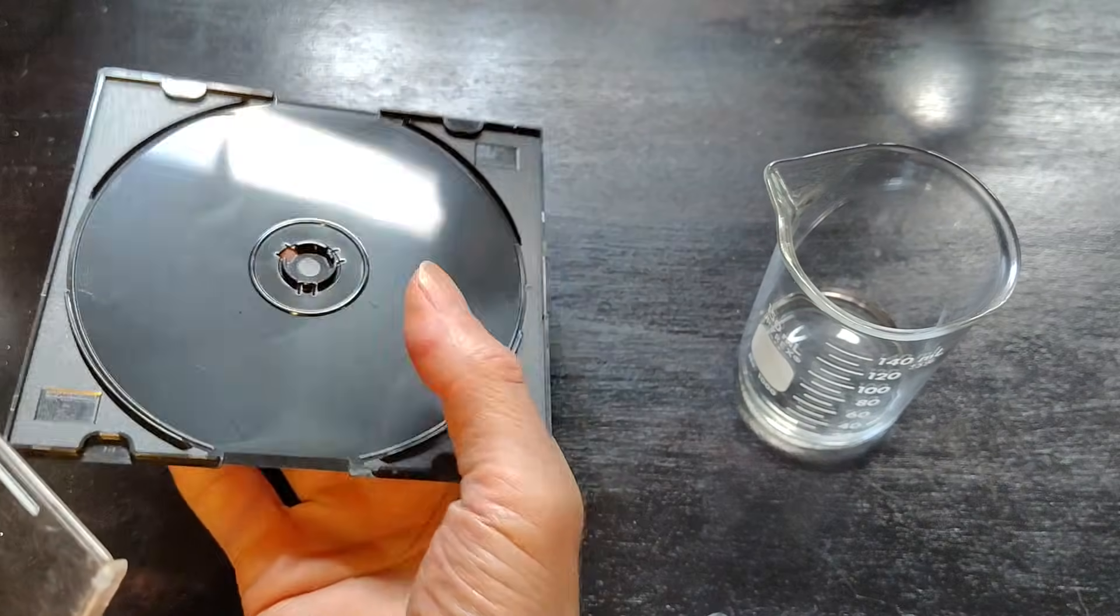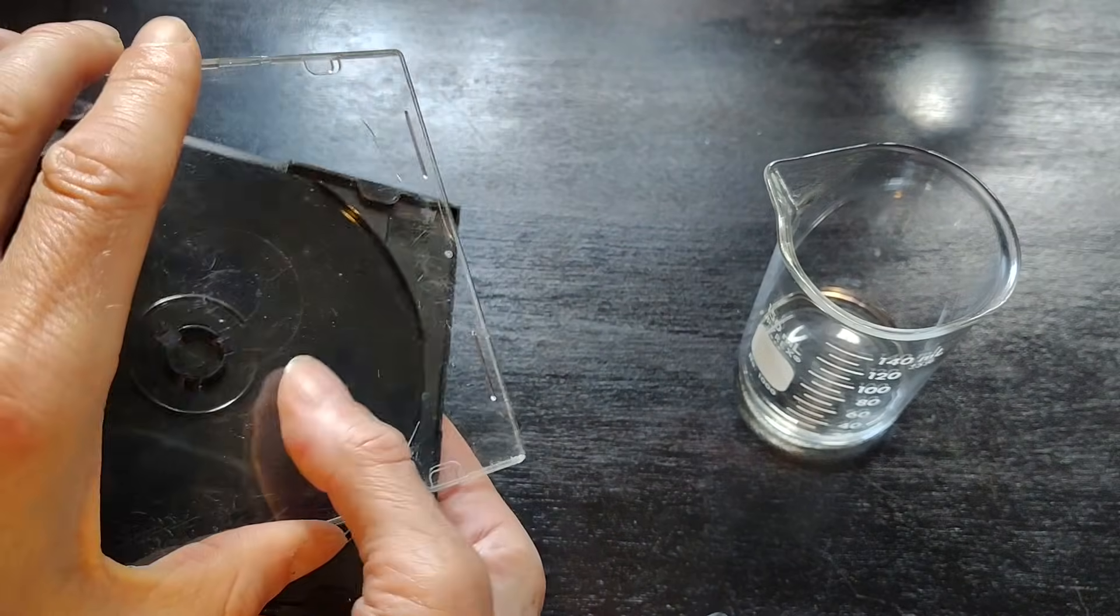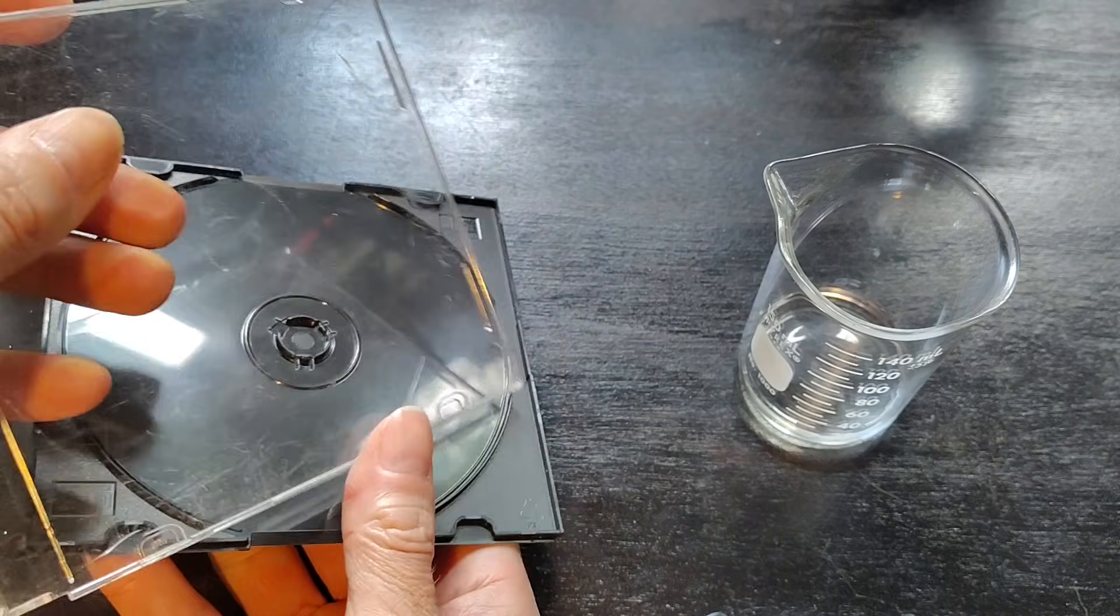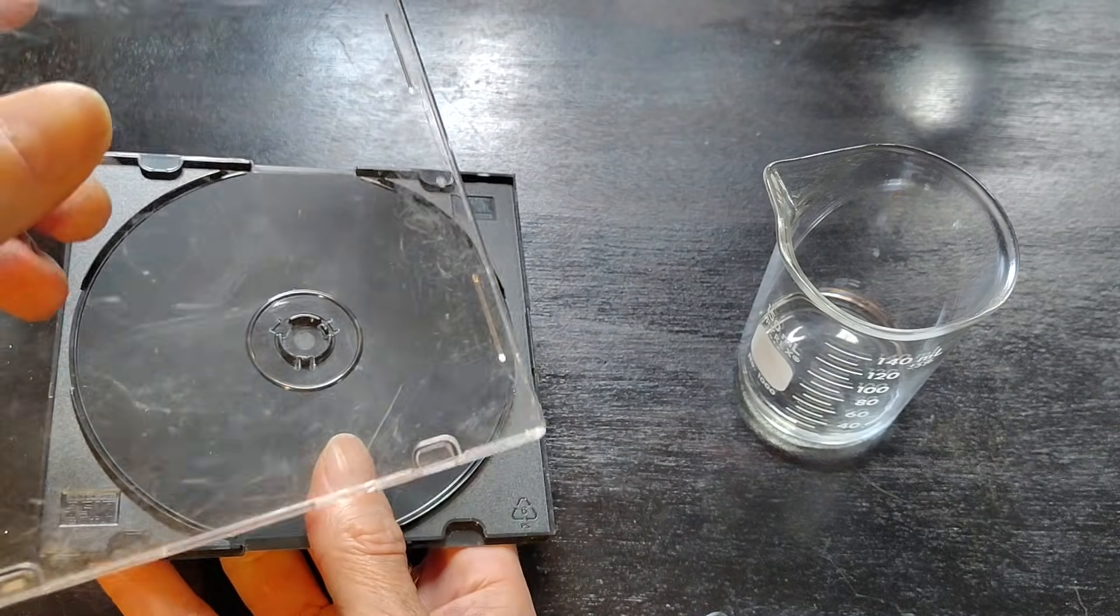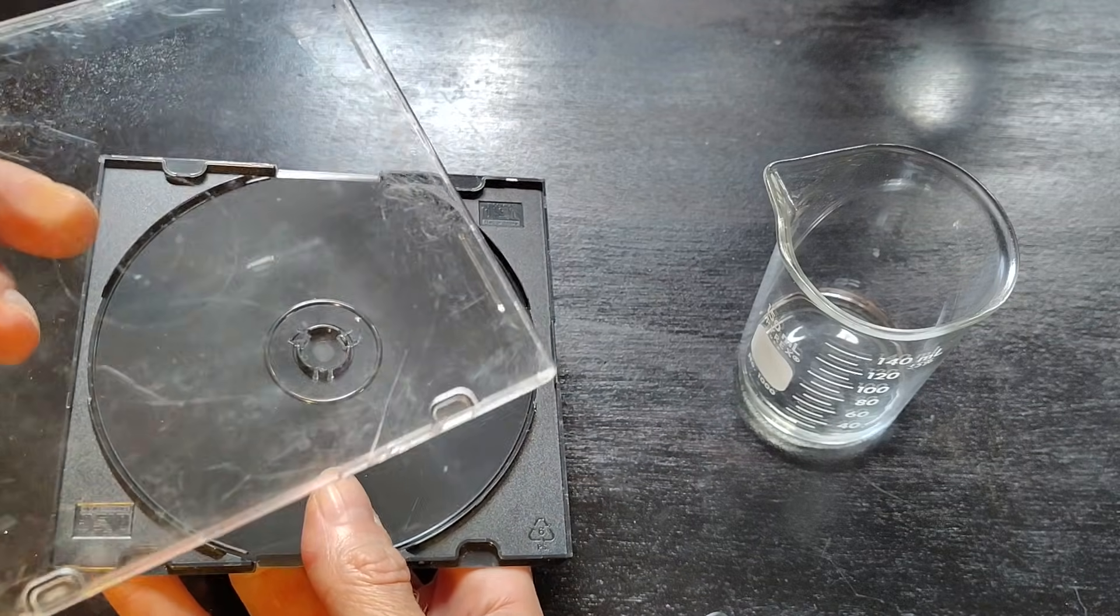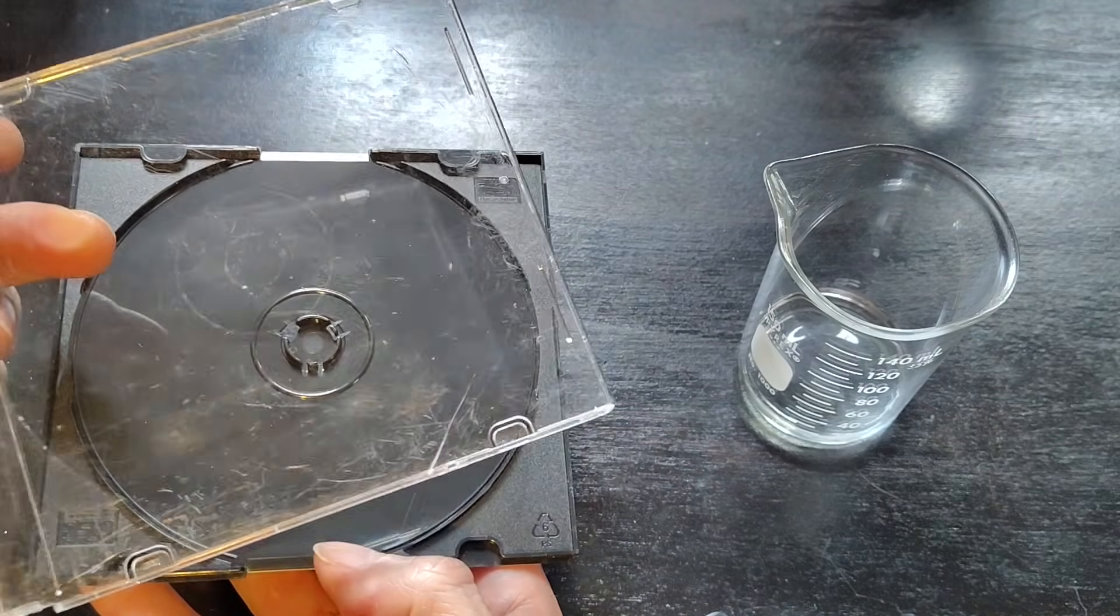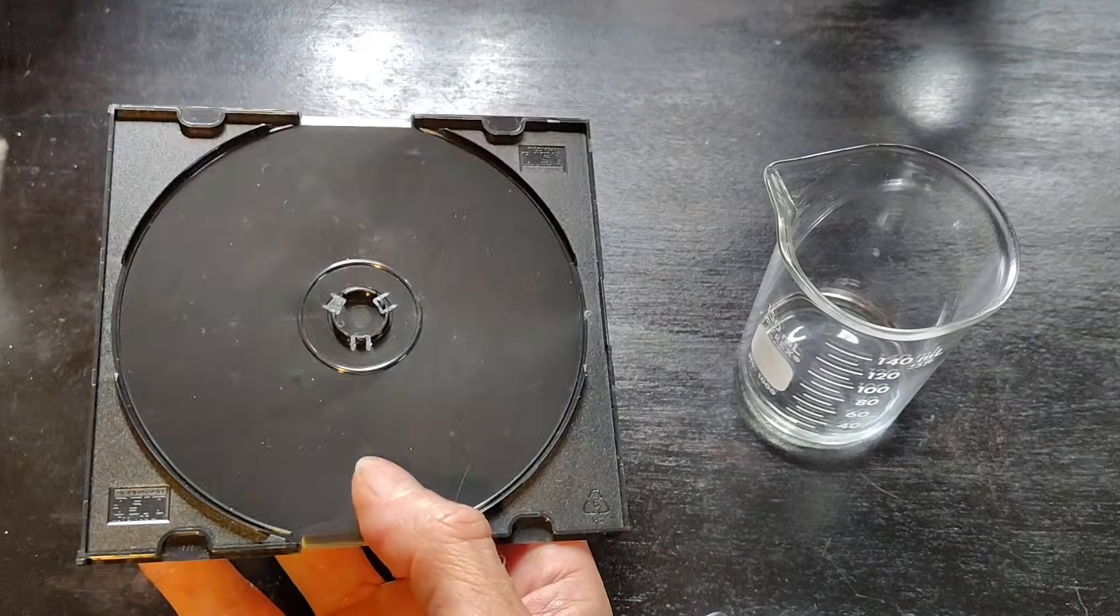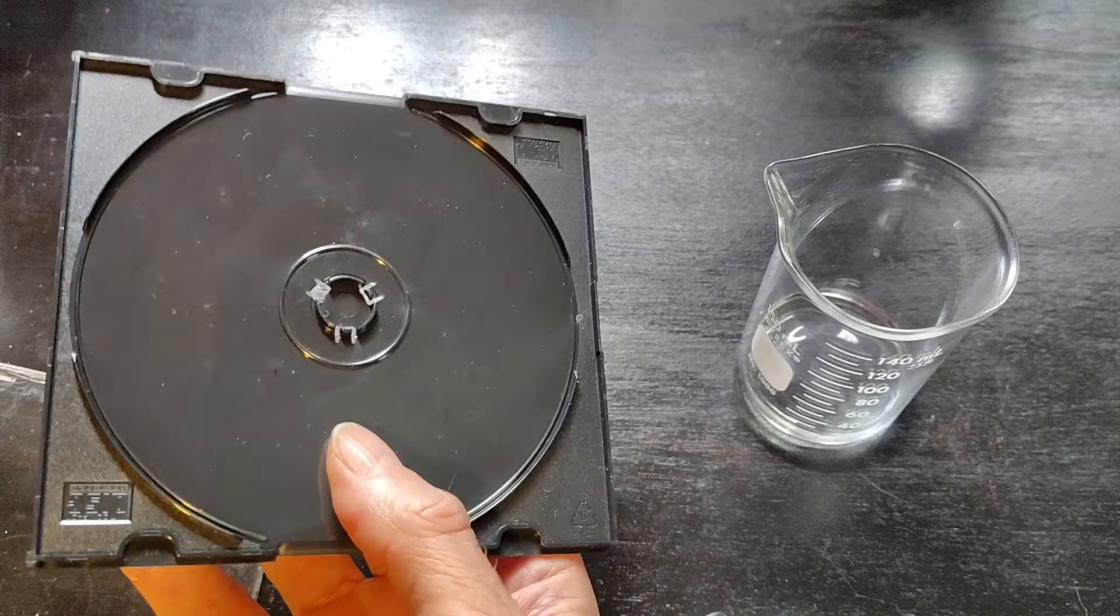Now both the black part and the transparent part of the CD case will work, but the transparent one is more fragile and will become even more brittle as you transform it into a proton exchange membrane. So I strongly recommend working only with the black part.